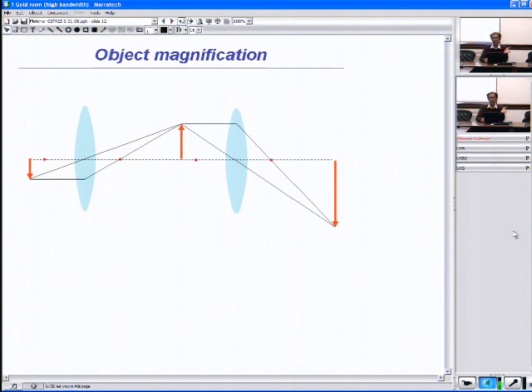And all of that is simply to say that the lens quality matters tremendously. And in this day and age, the ability to manufacture small lenses and to do so relatively cheaply has greatly improved our ability to make imaging systems compact, to have multiple lenses that correct for aberrations and provide very high quality images.